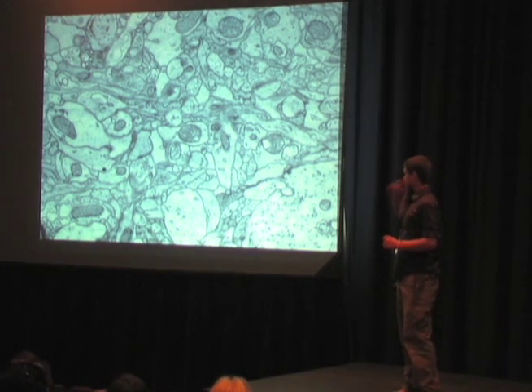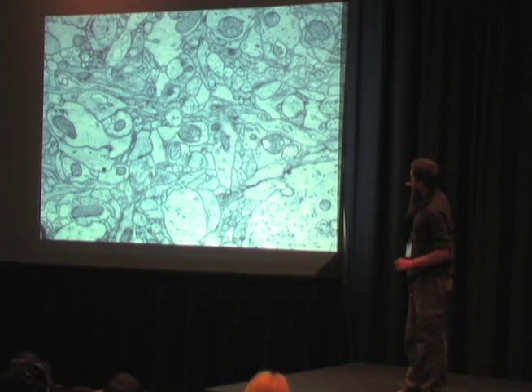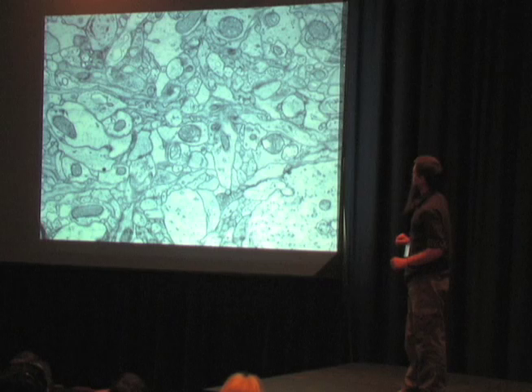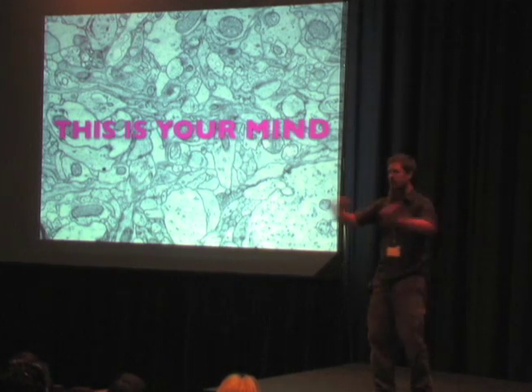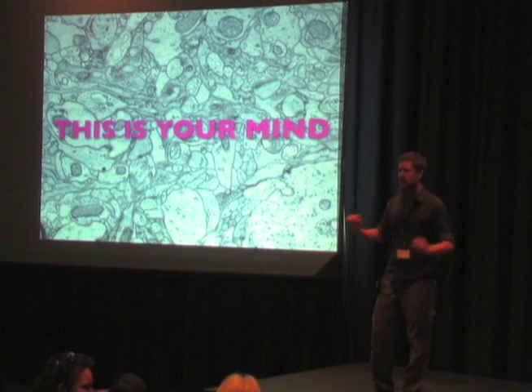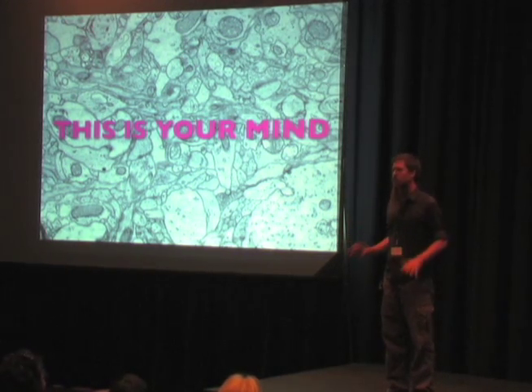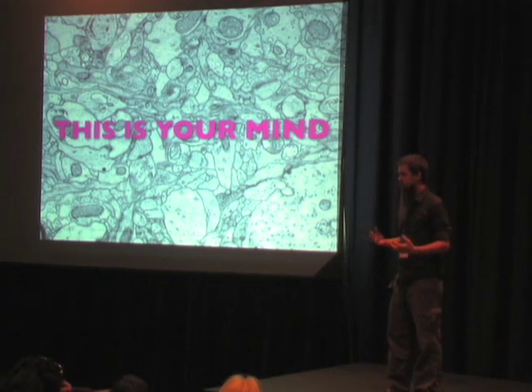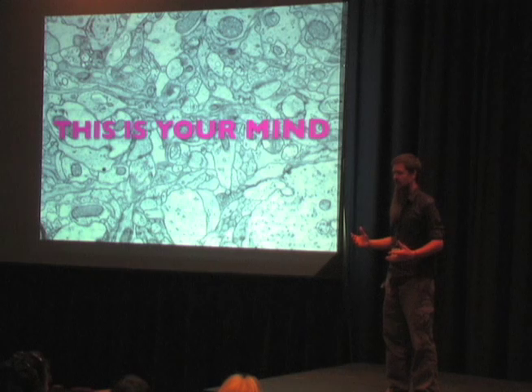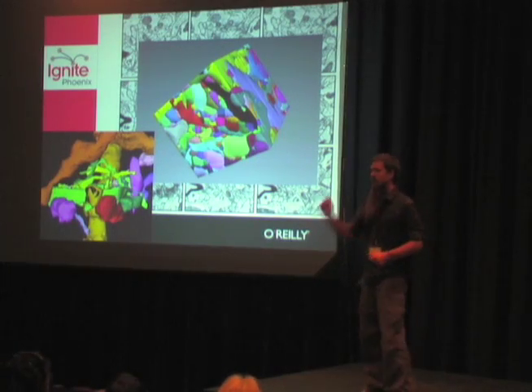This is a brain at full resolution, arguably. And you should be totally overwhelmed by this picture. I am. Sometimes I watch videos of the data, because you can fly through it. And I have seen this. This is your mind. It's totally overwhelming to watch videos of just the raw data coming through. And then at some point you go, holy shit, they just digitized that. And once you digitize it, then you can hit it with a lot of hammers.